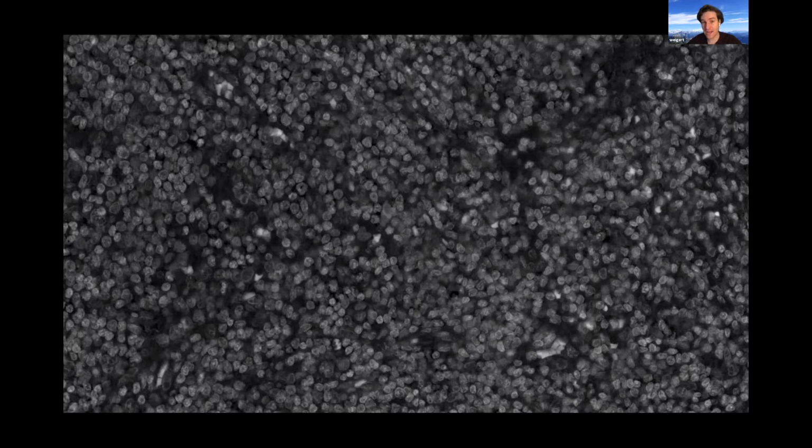And the network or any segmentation pipeline would give you a result that says it's a nucleus. Would you be satisfied with that or not? Because you would have to always compare it to your own annotations, right? Yeah, I mean, philosophically speaking, most people will believe in their own opinion, at least, or else it's not an opinion, right?